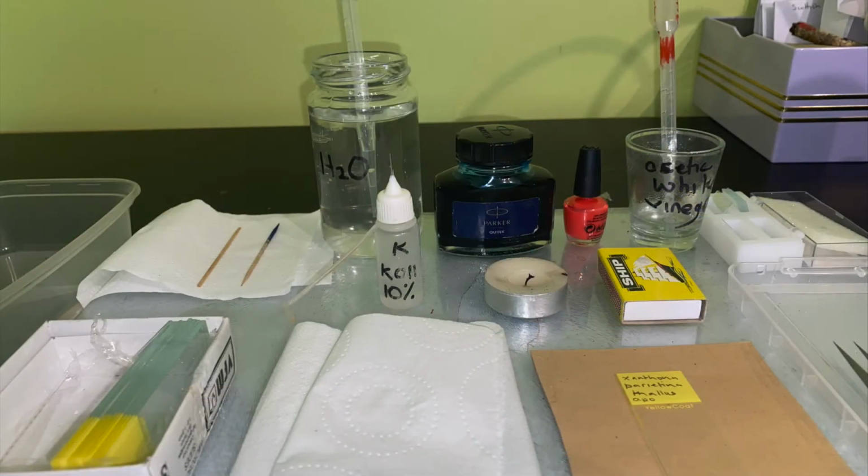Label most of the pieces of equipment. For example, in this picture you can see that I've labelled the water, the dropper bottle of K, the acetic acid, the pipettes, and so on. It is important to label each glass slide with the key details of the sample that you are taking. It is quite easy to get your slides mixed up if you are making more than one type of preparation in the same session.